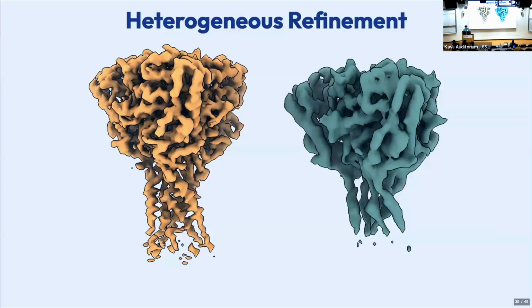Yeah, one approach that I've used with the class similarity parameter is, unless I'm looking at a very, very tiny difference, I'll typically keep it at 0.5. Then if I notice the issue of class collapse, where all the particles go to one class and you end up with nine empty classes and one class with a bunch of particles, I'll start to increase that a little bit, just to help the algorithm stay a bit more stable. That's one approach that we sometimes use.